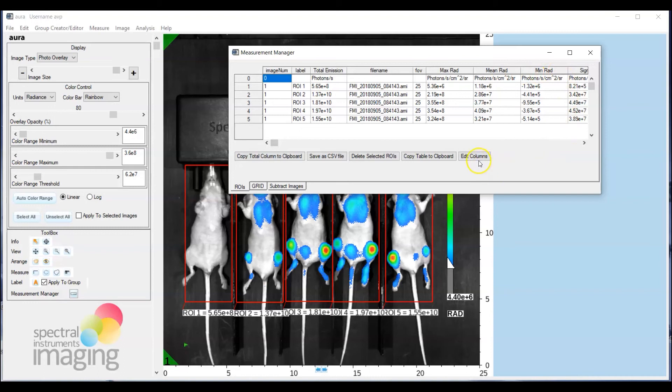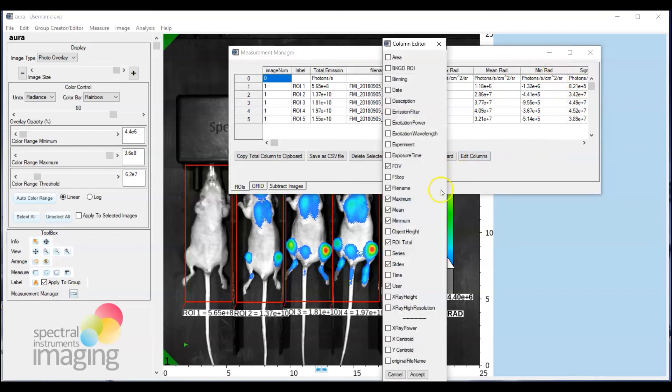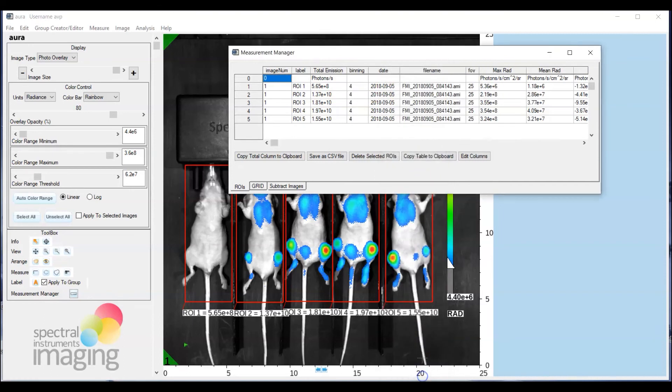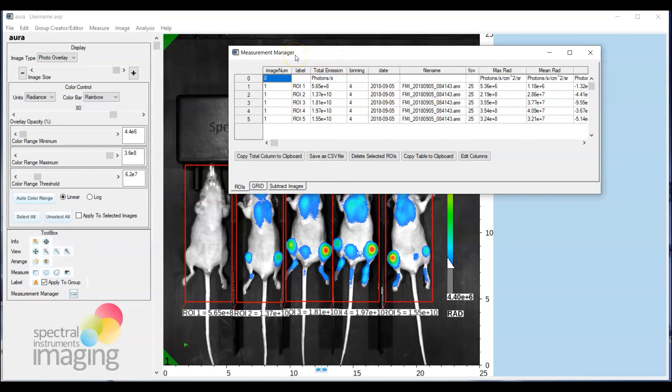You can add to this by going to edit columns and selecting whatever additional parameters would be of interest let's say date and binning and accept that and that would then get added to the overall data set of the measurement manager presentation.